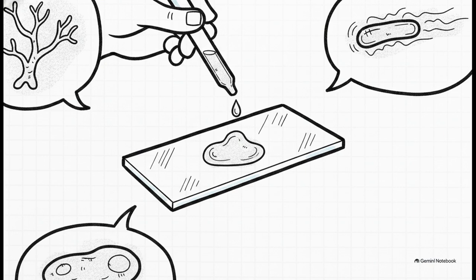Whether we are literally melting away human skin scrapings, hair, or nail clippings with a harsh 20% potassium hydroxide, or KOH prep, which I know sounds totally brutal, but it perfectly digests human keratin to clearly reveal intact fungal hyphae or yeast cells. Or, just using a simple saline wet mount to catch motile organisms darting around live in action. We can even use iodine wet mounts to enhance the visibility of internal structures in stool specimens for parasitology. It's all about catching the organisms in their most natural state.